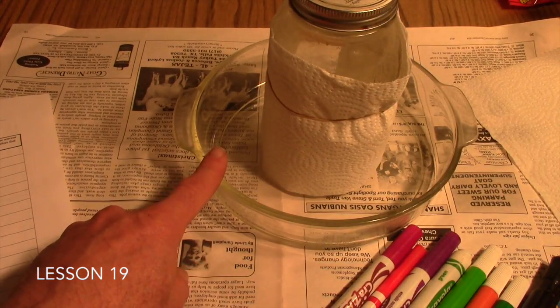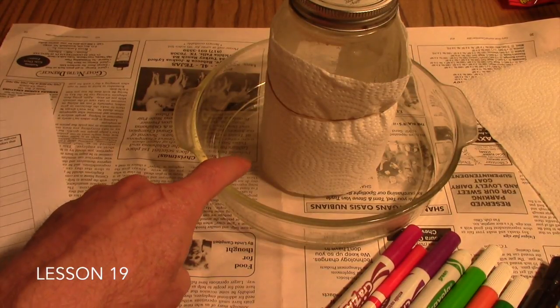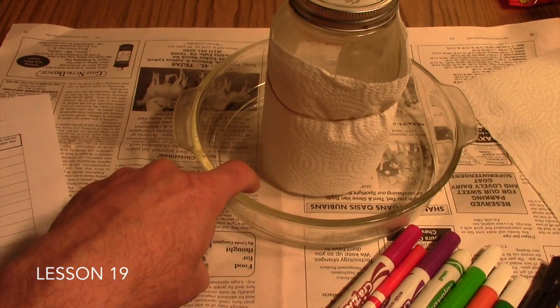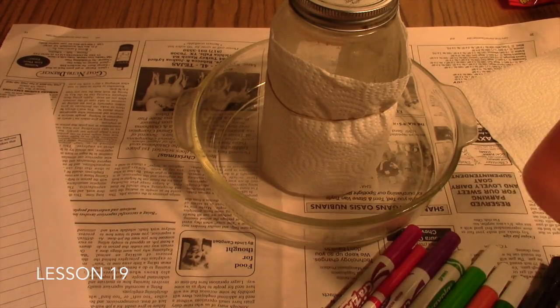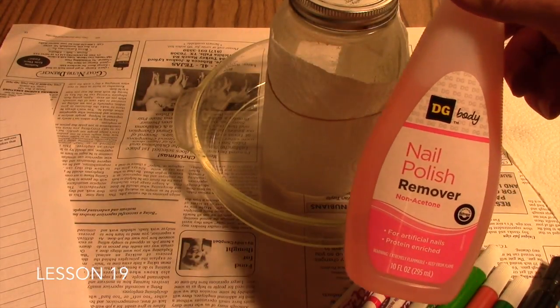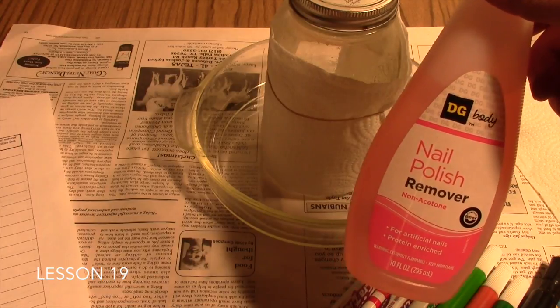Now, you'll have options of using different solvents in the lab. We'll demonstrate here on this video using water as our solvent. Another solvent that you can try is a fingernail polish remover, and a third is rubbing alcohol.